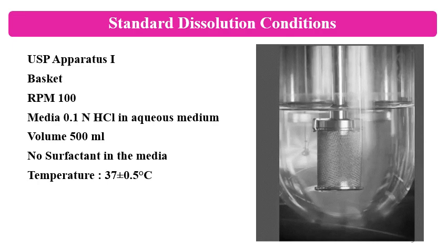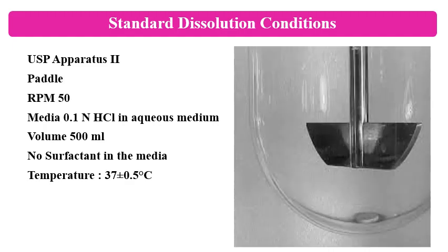So this is the standard dissolution condition. Media volume is 500 ml. If you want to increase the media volume, then justification is required. If you want to change the dissolution media apart from 0.1 normal HCl, then justification is required. Then the standard dissolution condition for paddle apparatus.